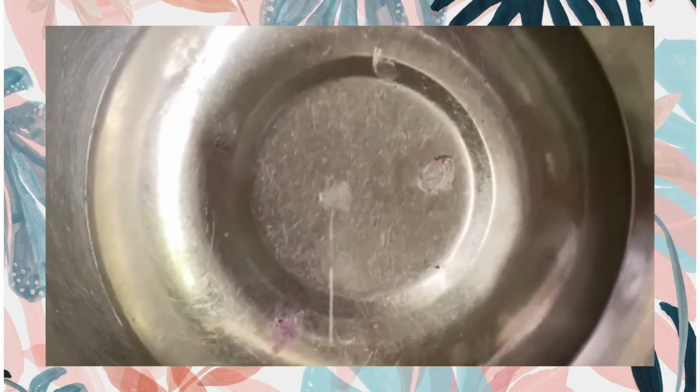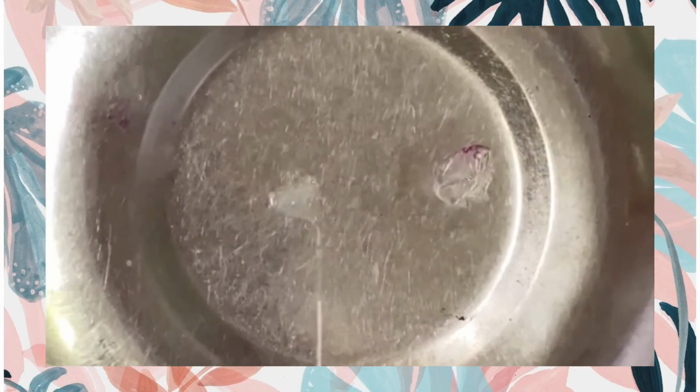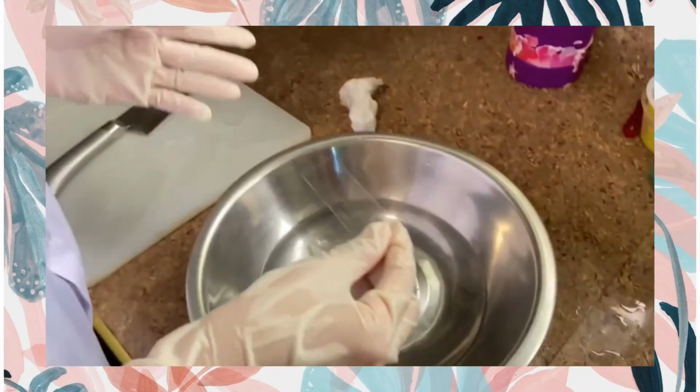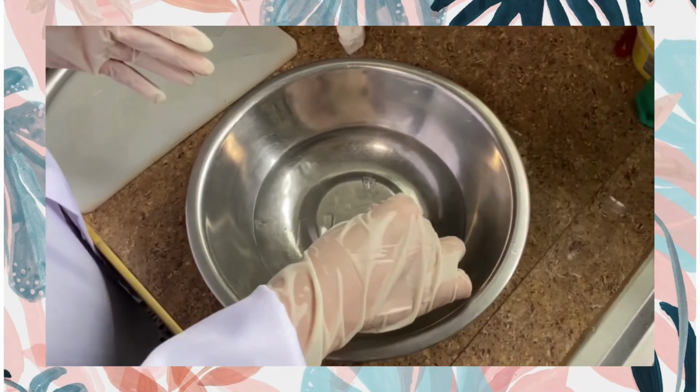Then put the specimen on the hot water. Using the slides with adhesive, fish out the specimen carefully.